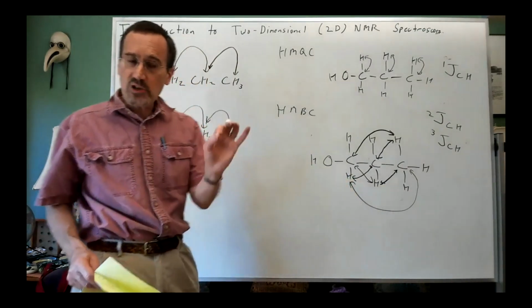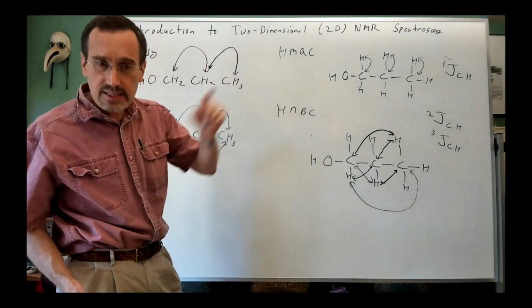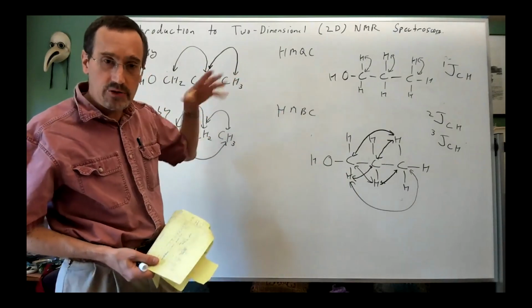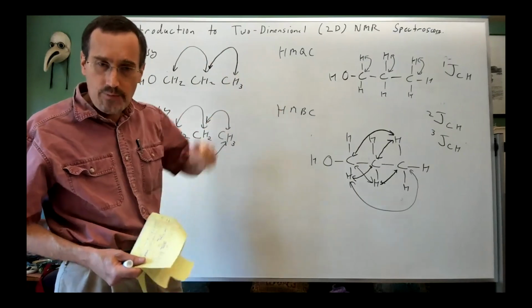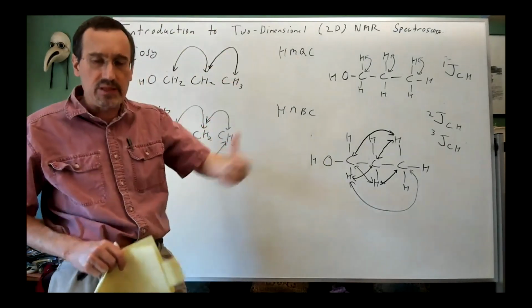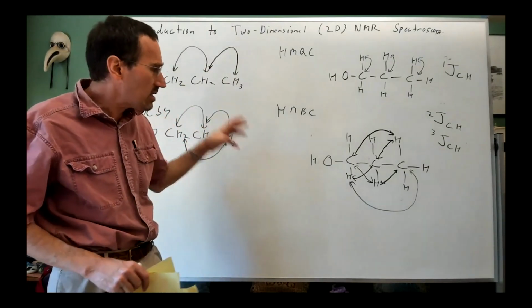But when you have a targeted problem, like where is that carbonyl group attached, or where is that isolated methyl group attached? The problem I was talking about that we encountered in part 2, problem 2 on the exam, where people were struggling to put together the CH2 group and the methoxy group and the methyl group and the 1,2,4-trisubstituted aromatic and the carbonyl group and the hydroxy group.